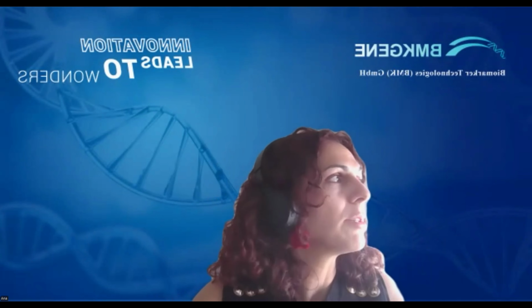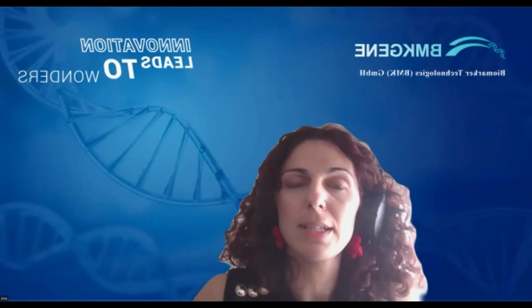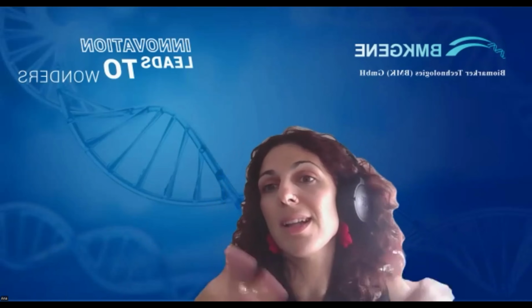So we use CARD for antibiotic resistance, and we also use databases for heavy metals and for carbohydrates. So we have this distinction between general functional databases and more specific marker gene databases. In the end, you get a functional analysis that has all of these different results.